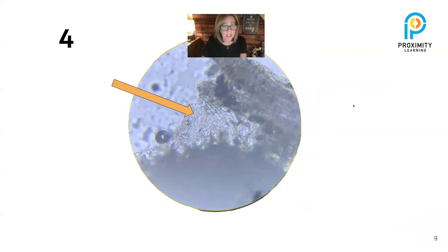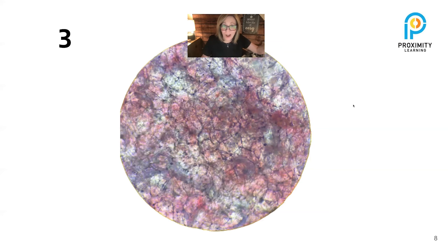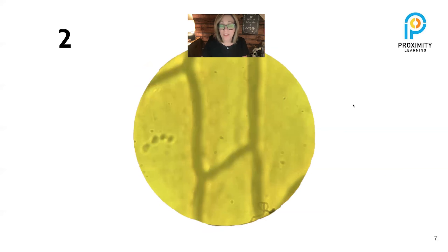Here's the lower epidermis from the bottom of a leaf showing plant cells. This was a grape — I pulled off the skin and put it under the microscope, and the kids loved it. Finally, I had a slide from my veterinarian of my dog's blood cells. It wasn't real blood but a sample the vet gave me years ago, and it worked really well under the microscope.